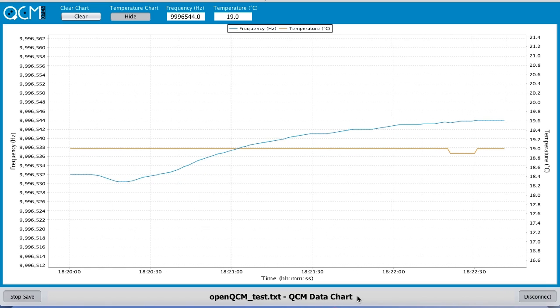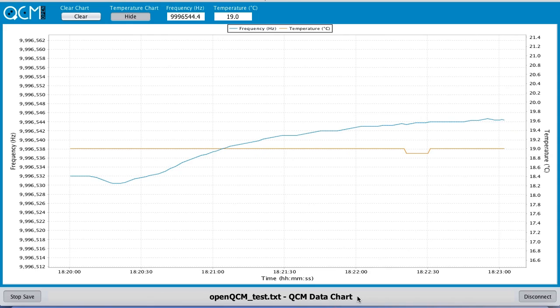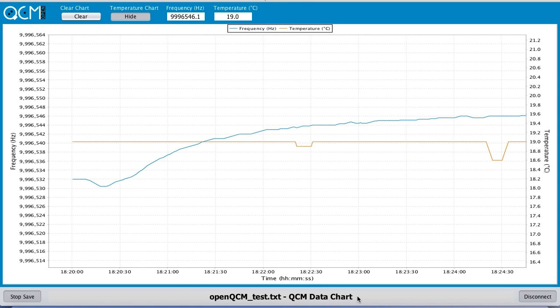Wait until OpenQCM reaches an equilibrium. This depends on the working conditions.